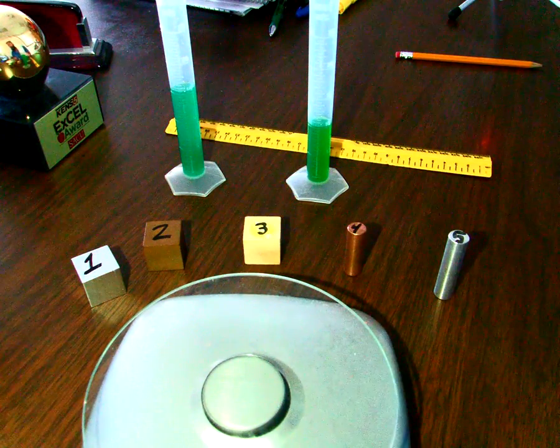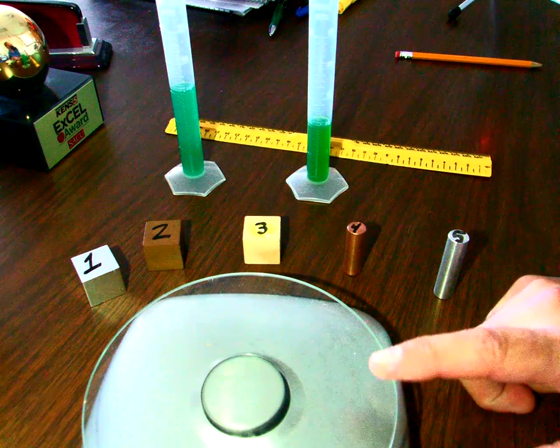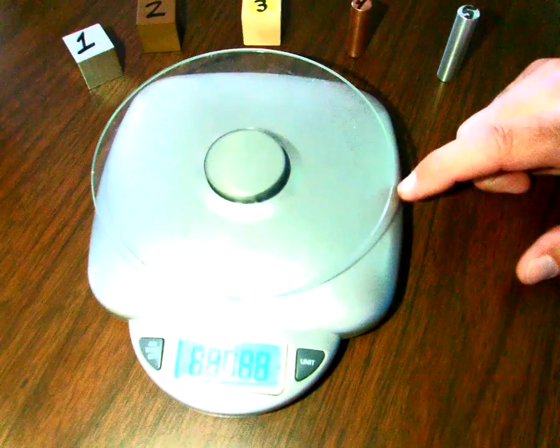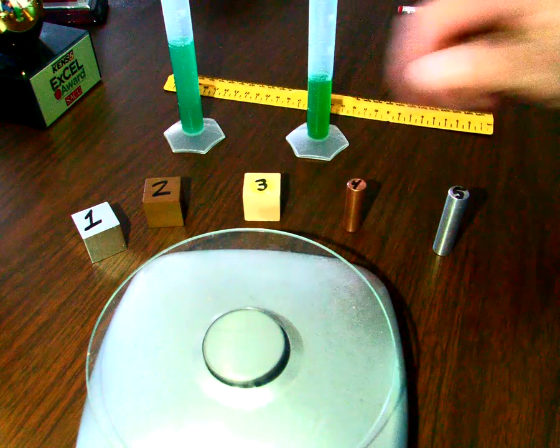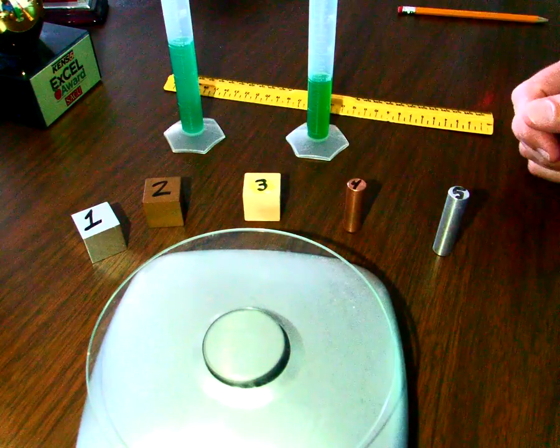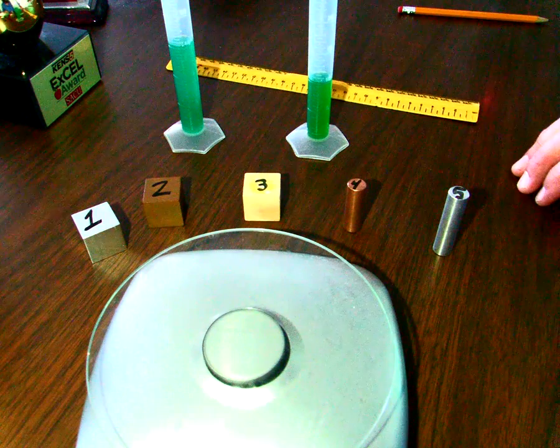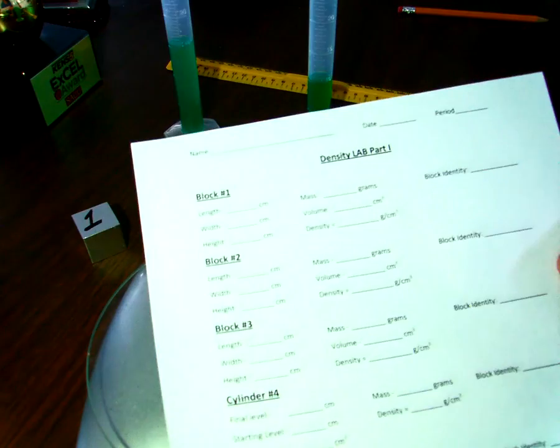All right, so we are going to go ahead and get started with our density lab. Notice we have a few items. We have our digital scale, and we will use that here shortly. And we have 3 unknown materials and blocks, and we have 2 cylinders, numbers 4 and 5. We have 2 graduated cylinders with different colored volumes of water, and we have our ruler here. The last thing that you will need, of course, is your data sheet.